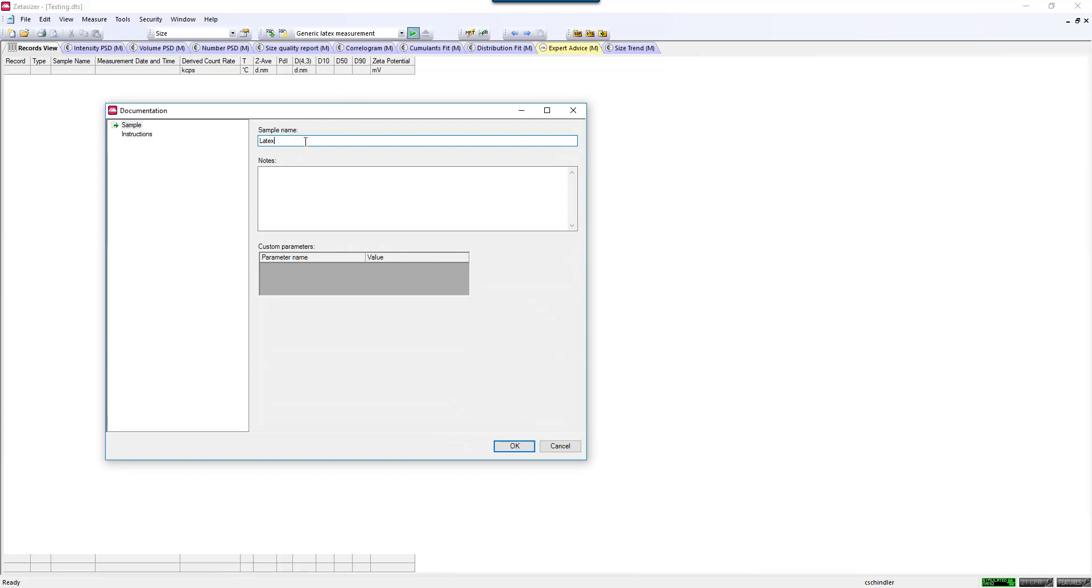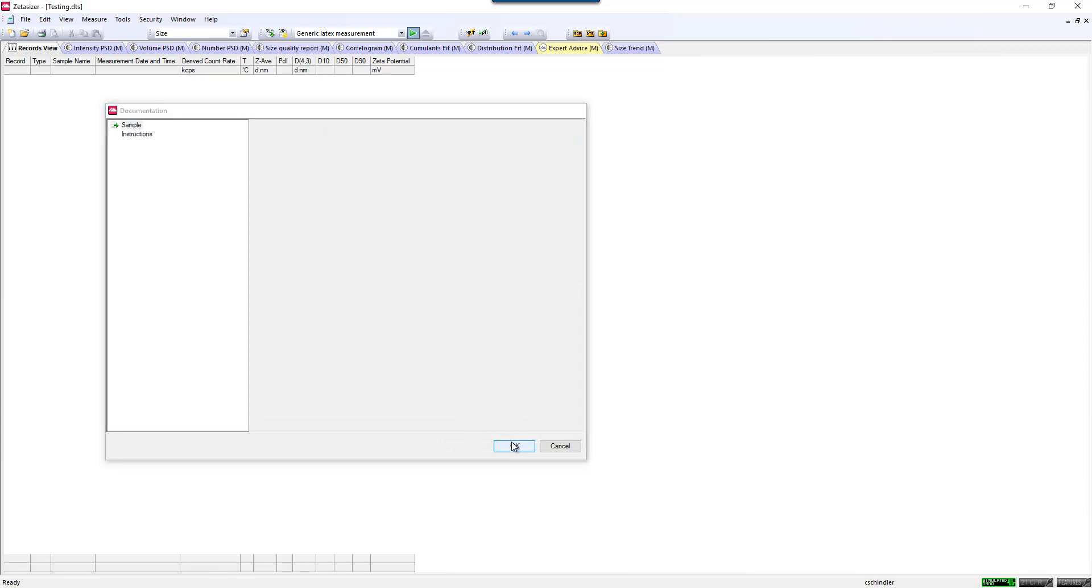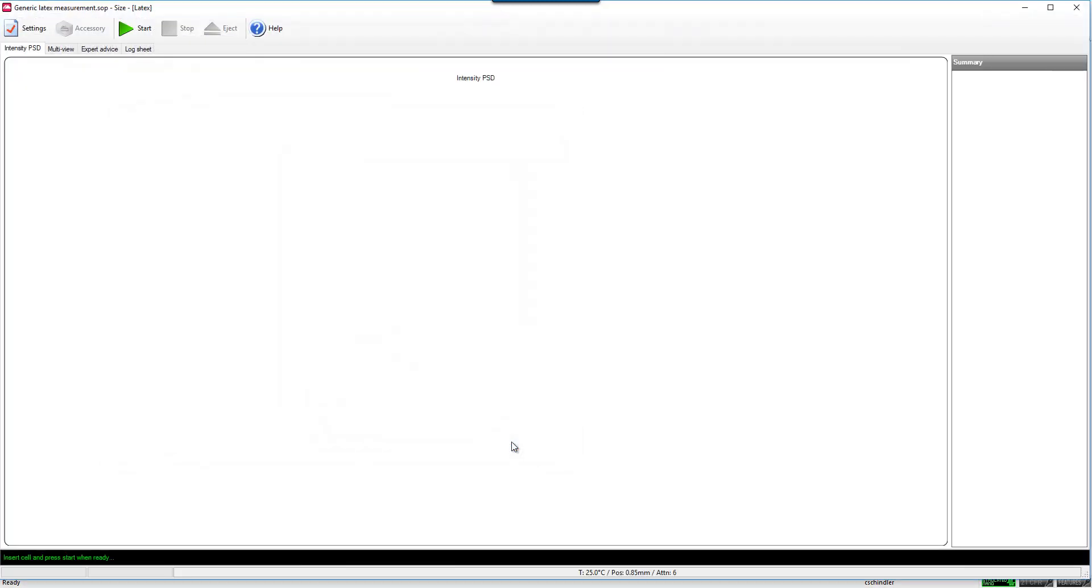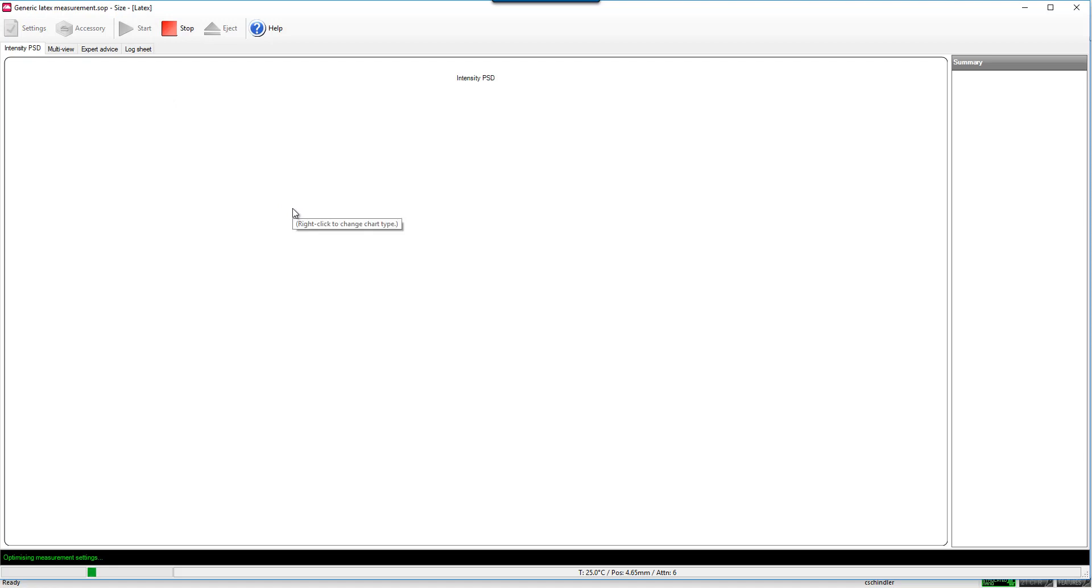You would then be prompted to enter in your sample name and hit OK. You would simply insert your cell into the instrument and press Start whenever you're ready, and your measurement would proceed.